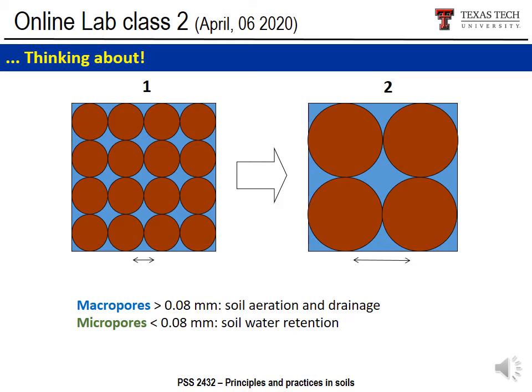It contains smaller soil aggregates. The soil aggregates may be the red balls, like spheres. And the soil pores are smaller than in box 2, the cube 2. But the total porosity of box 1 and box 2 is the same.